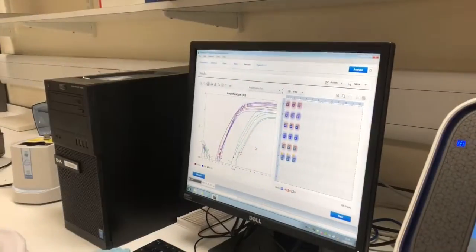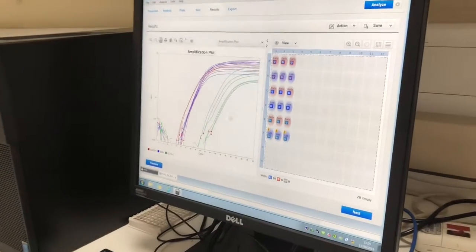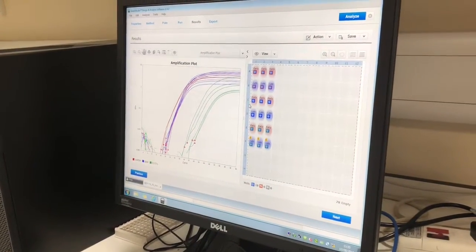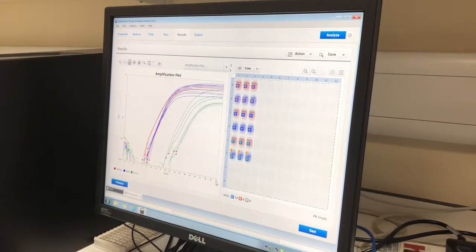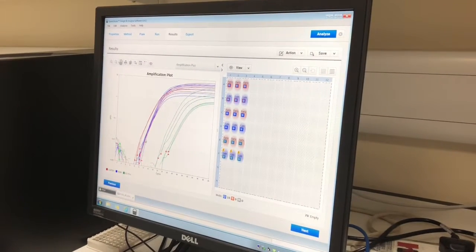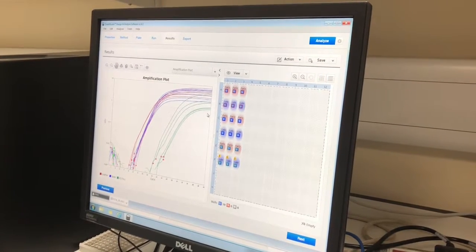I'll show you an example of some of the data that we get off of the quantitative real-time PCR machine. So this is just the plot that we get back at the end of the run that shows us over the 40 cycles of the PCR how the amount of the gene increases exponentially and then reaches a plateau.